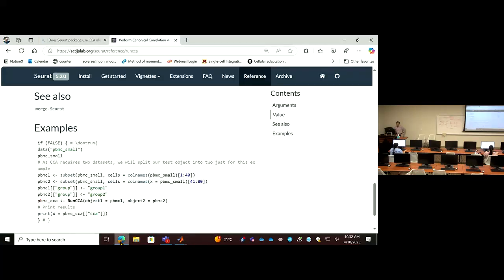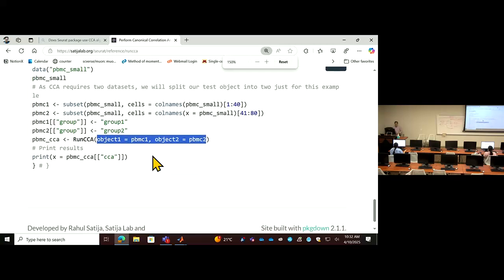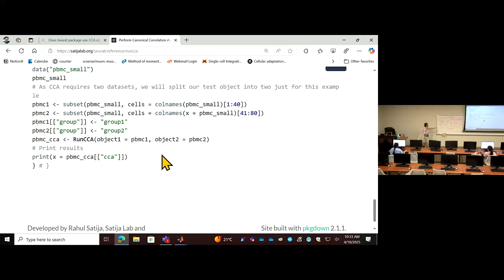So before I start, I ask how the Seurat package is using CCA. One thing I don't understand is that in these applications to run CCA, the two samples are from different cells. If you have two matrices, for example, one matrix contains 300 cells, another has 500 cells, this example is very different from what we showed here, because here you have a matched number of cells.